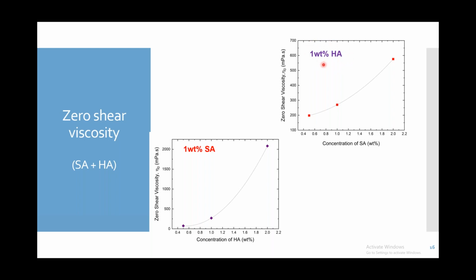Actually, for single component systems, there are various models, like the Martin equation that we use for sodium alginate. There are models that we can fit to our data to estimate intrinsic viscosity. But I think for blended polymers or complex systems, this kind of analysis becomes complicated due to the nature of the mixtures, and it likely depends on how the molecules interact with each other.